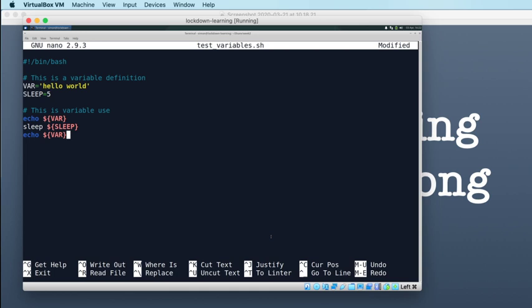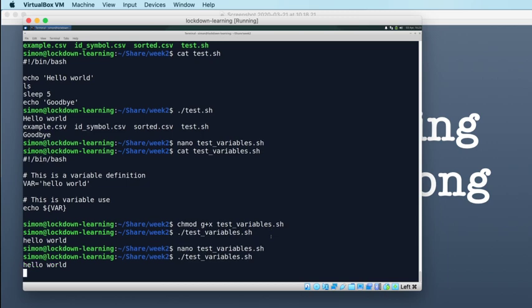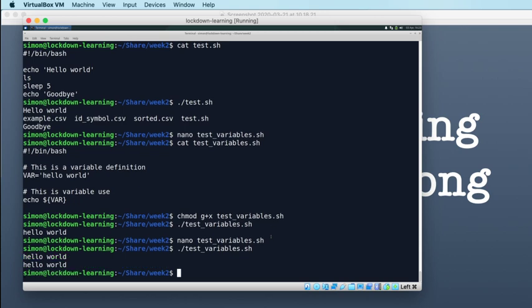Now I'm just looking at the comments. Sorry, I'm just distracting myself by looking at the comments. The first thing that springs to mind is whether there's a space between the shebang and the bin bash, which I think breaks things. Sorry, I just slipped into Vim there. Because I think if you put a space in, it doesn't work. Oh no, it does work. Okay, I take that back. So that's not the reason why people's scripts aren't working.